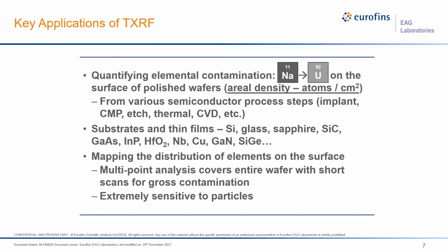We can pick up a single particle that's even just 100 microns by 100 microns on the surface, which can be both a great thing and problematic if you can't always handle your samples in a clean room environment. So next I want to go over the fundamentals of TXRF and just walk through what's actually happening with the sample when we're studying it.